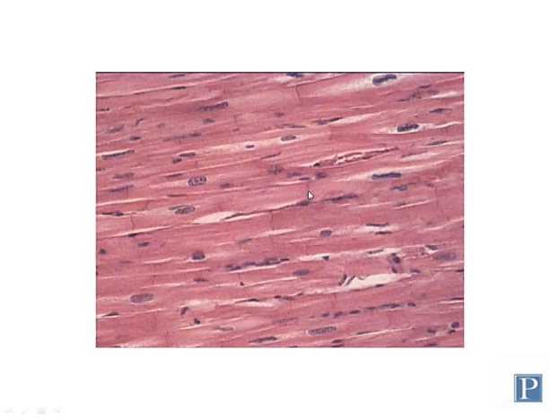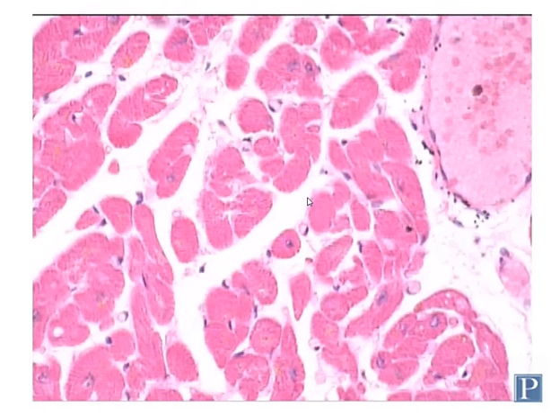Intercalated disks contain gap junctions and desmosomes, and there's an electron micrograph in the lab that shows these structures in much more detail, and they're actually kind of stair-step shaped structures where you find an interdigitation between the cell membranes of adjacent cells. So try to find the intercalated disks. That was what cardiac muscle tissue looks like in longitudinal section.